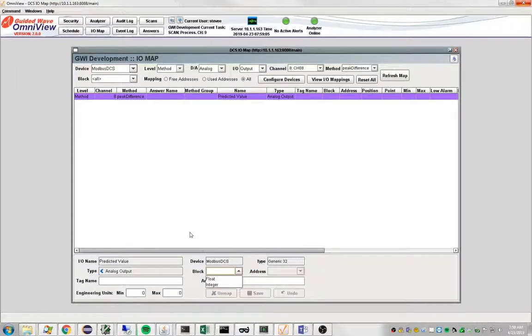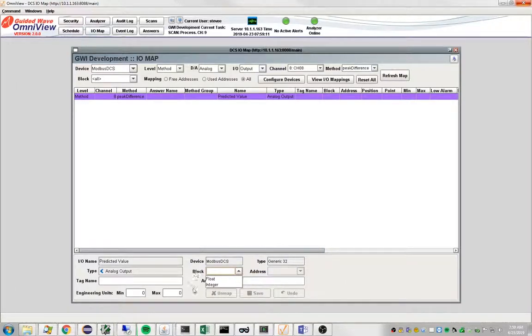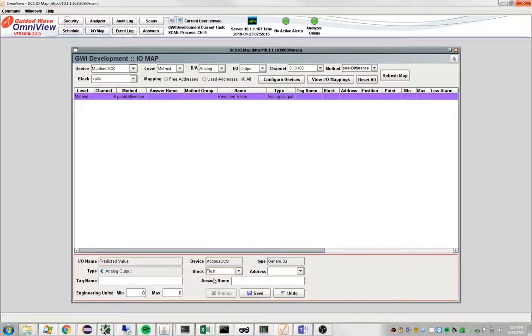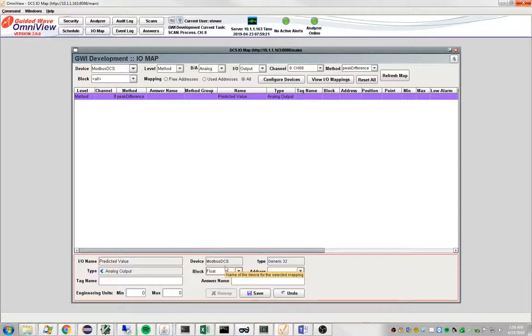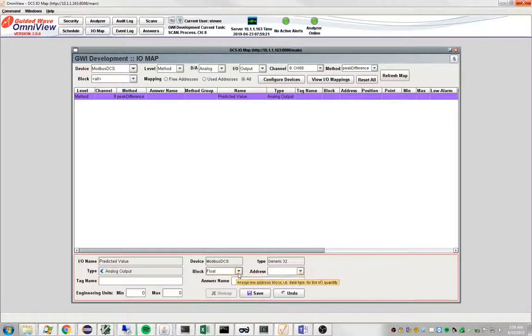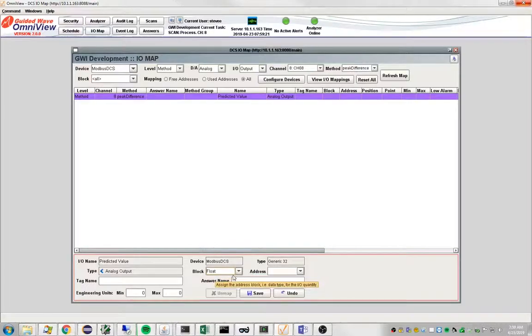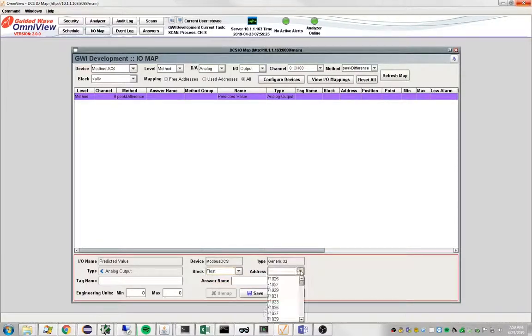The first one is essentially the type of the value that you're going to write out. It's going to be a floating point number. This determines what kind of Modbus address is going to be used.